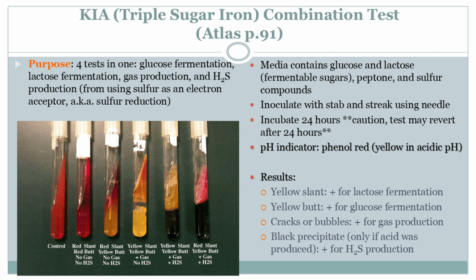Right. So E. coli, common resident of our gut. Most strains are harmless, but then there are the ones that give you those nasty food poisoning episodes. Exactly. Now, E. coli really love to ferment both glucose and lactose. They're the ones going for the full buffet experience, huh? That's them. So on the test, you'd expect to see that totally yellow tube, maybe even some gas production, depending on the specific strain. So it's like their metabolic fingerprint.